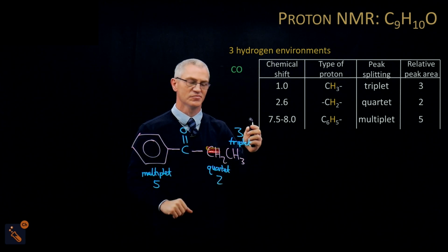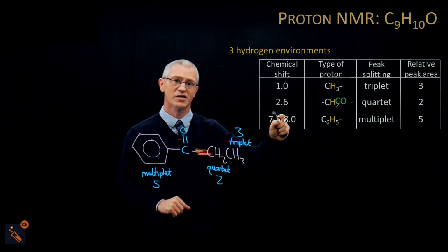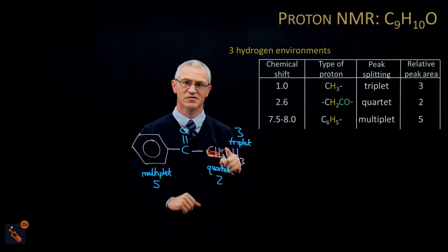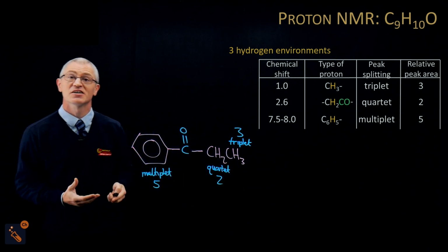So I'm just going to take that CO from there and put it down. You can see that CH2 is next to the CO.